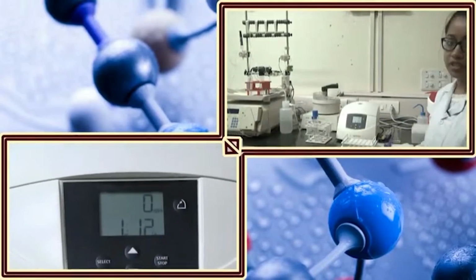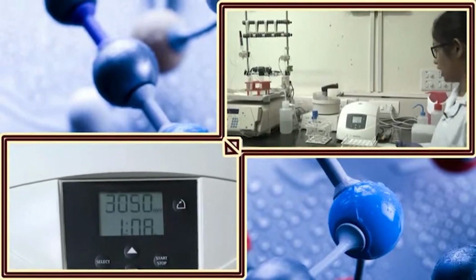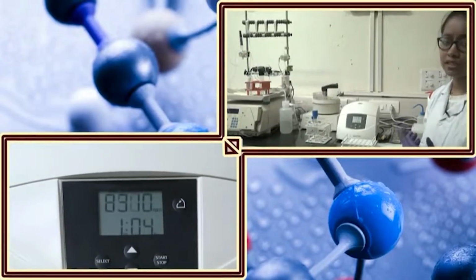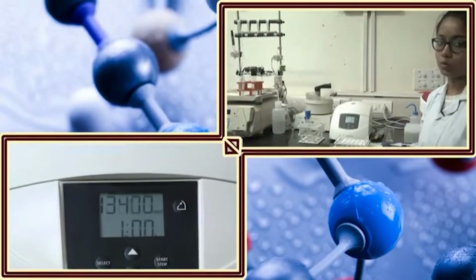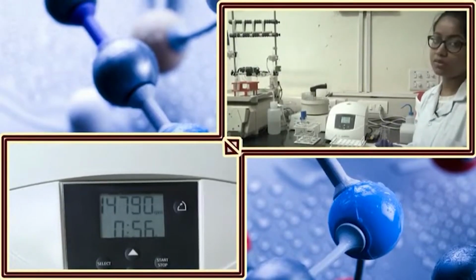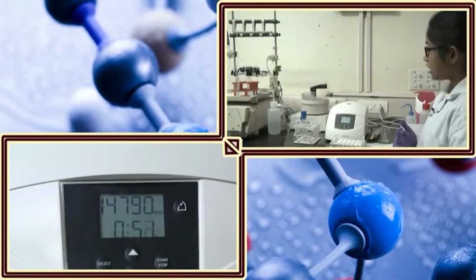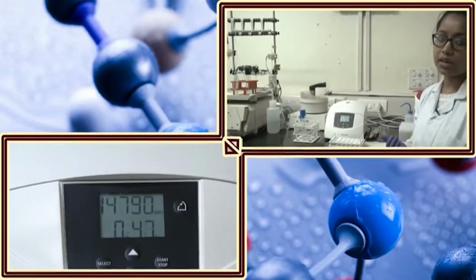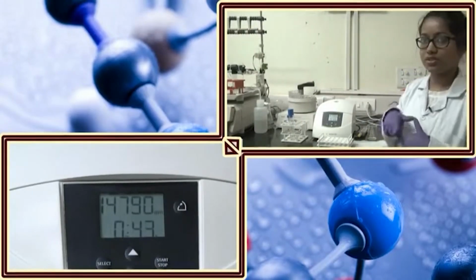Now, as I was mentioning, the copy number varies in case of different strains of E. coli. So, when you isolate the plasmid, if the plasmid content is very poor, the yield is poor, then it might happen that the bacterial strain you are using has low copy number. Okay, I will start again.